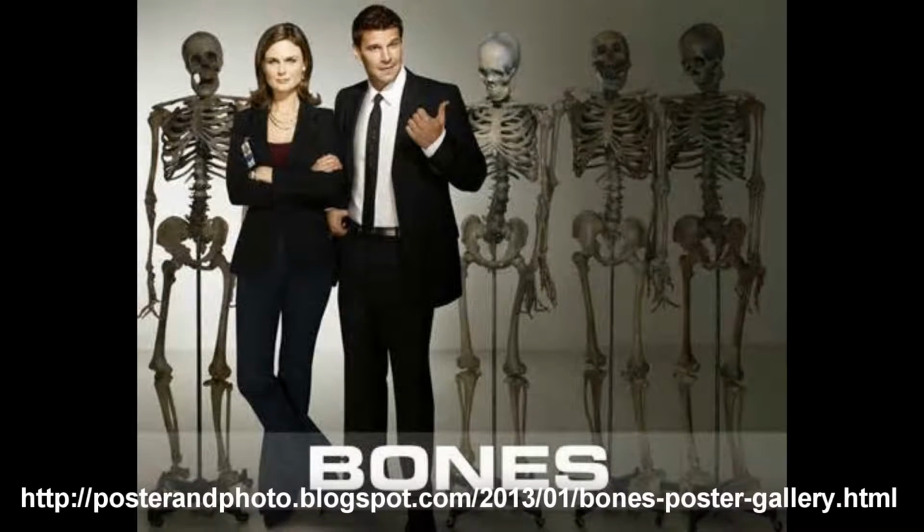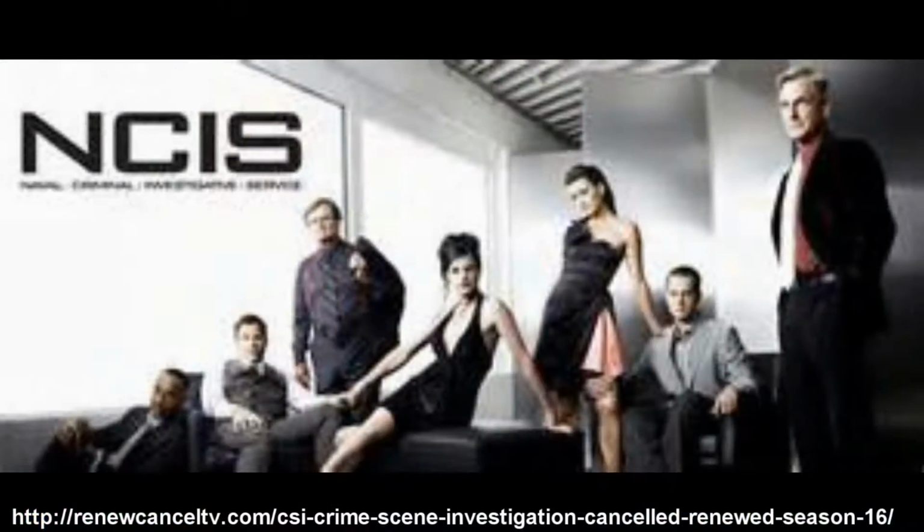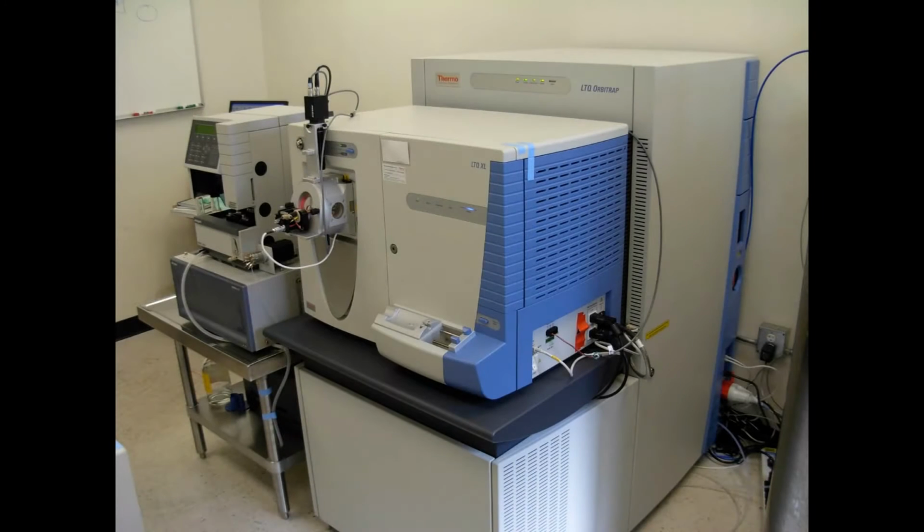Ever wondered how scientists and investigative TV shows determine the composition of a sample? Well, one device scientists use is called a mass spectrometer. A mass spectrometer is a device that separates a sample into its different components using electromagnetism.